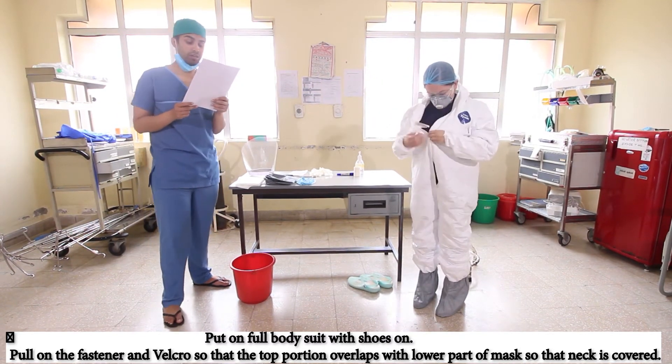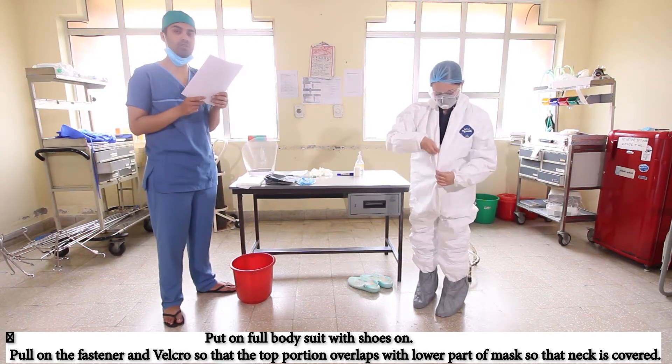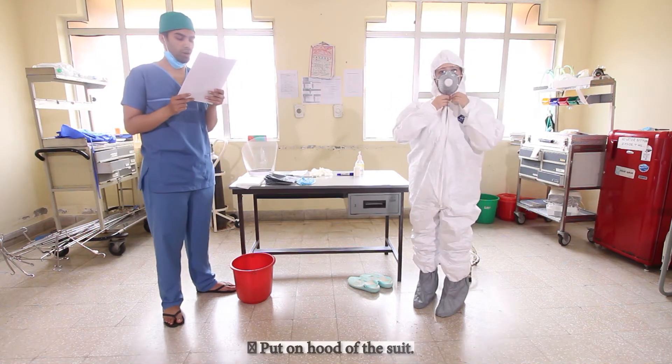We have to take care to pull the fastener and Velcro to the top so that the upper portion overlaps with the lower part of the mask, ensuring the neck is fully covered. Put on the hood of the suit.